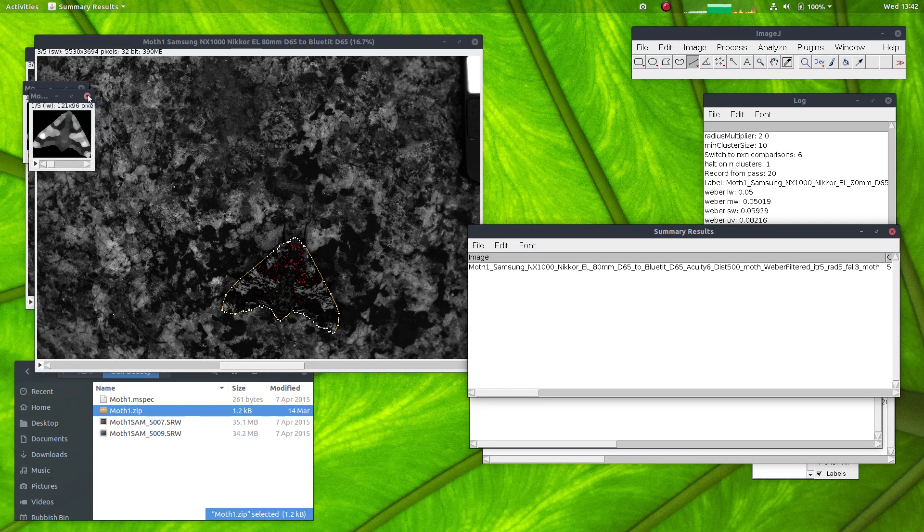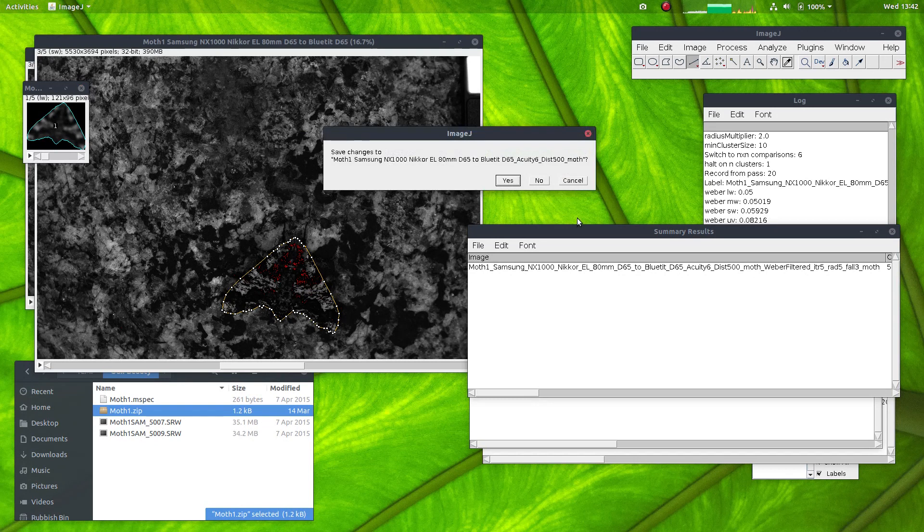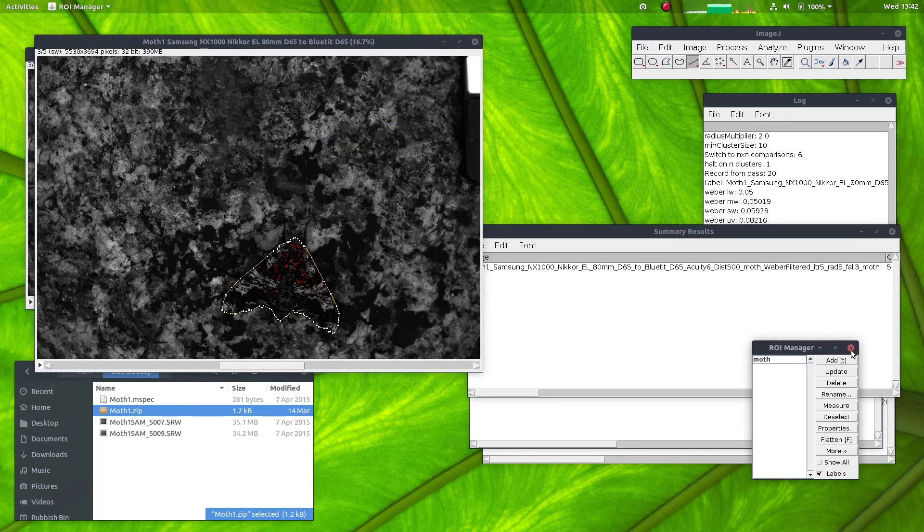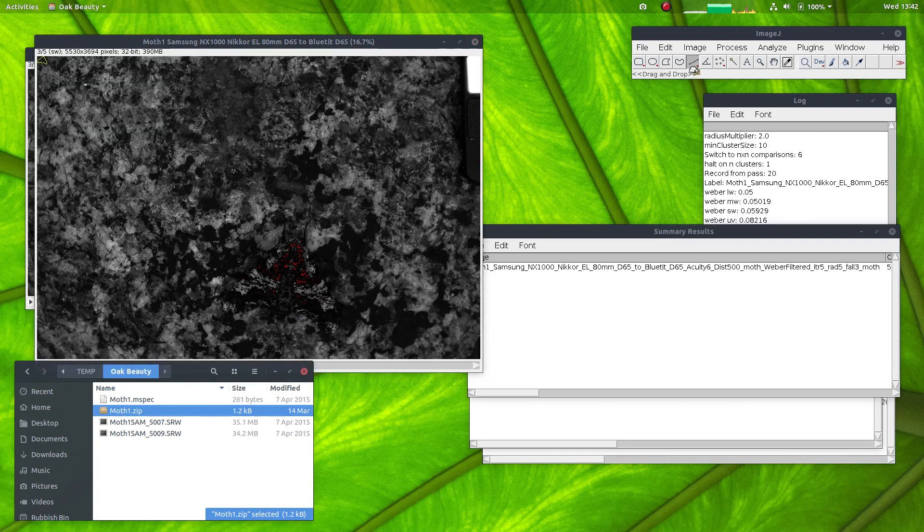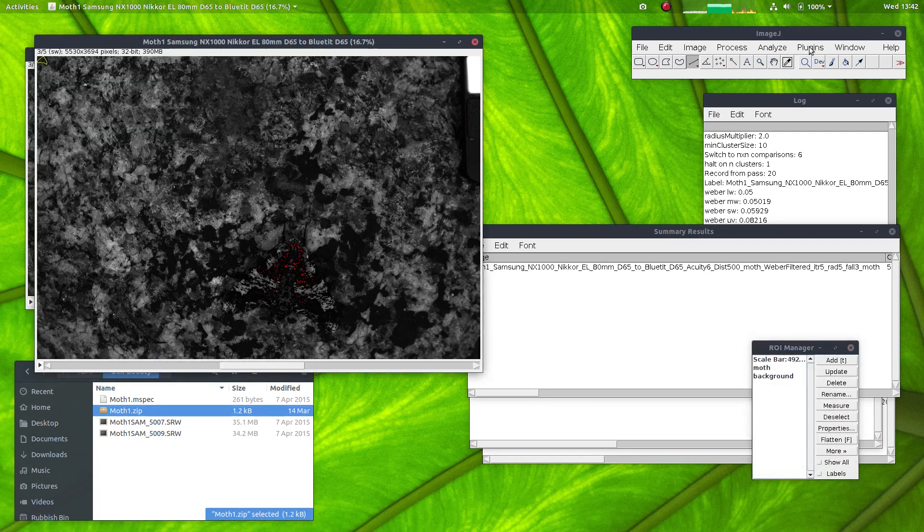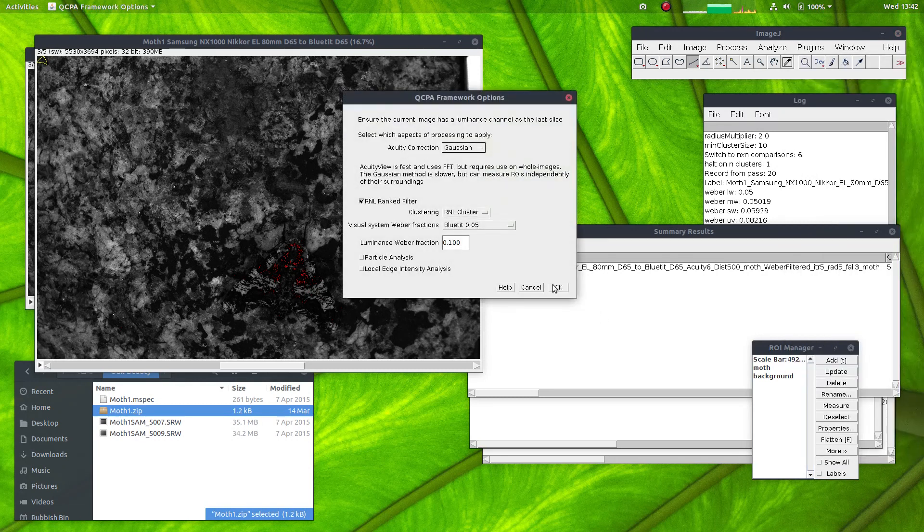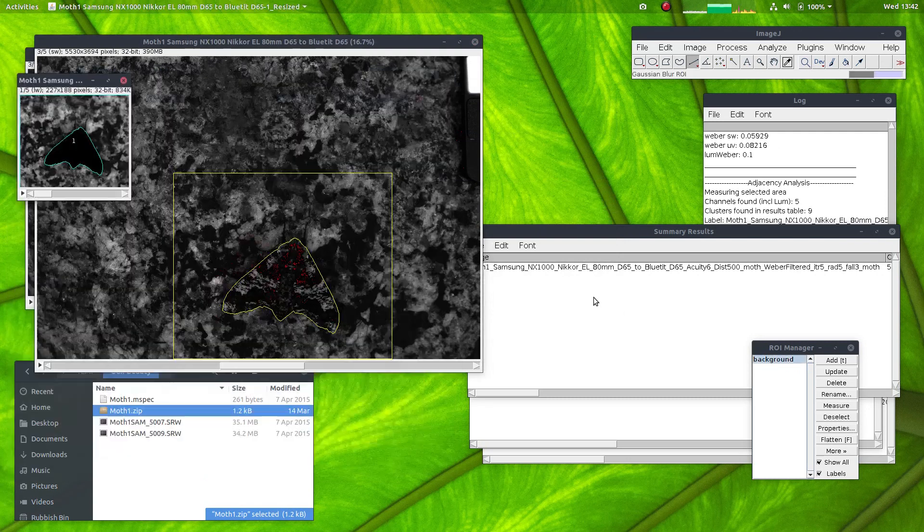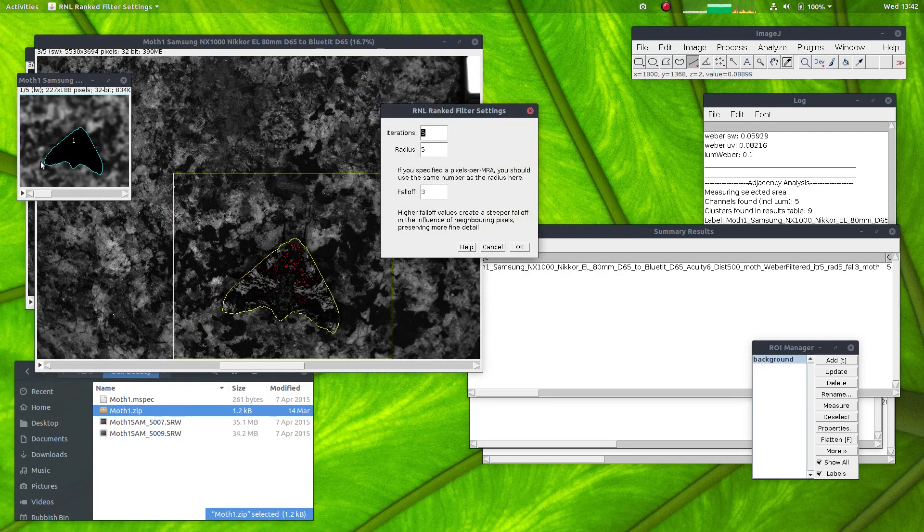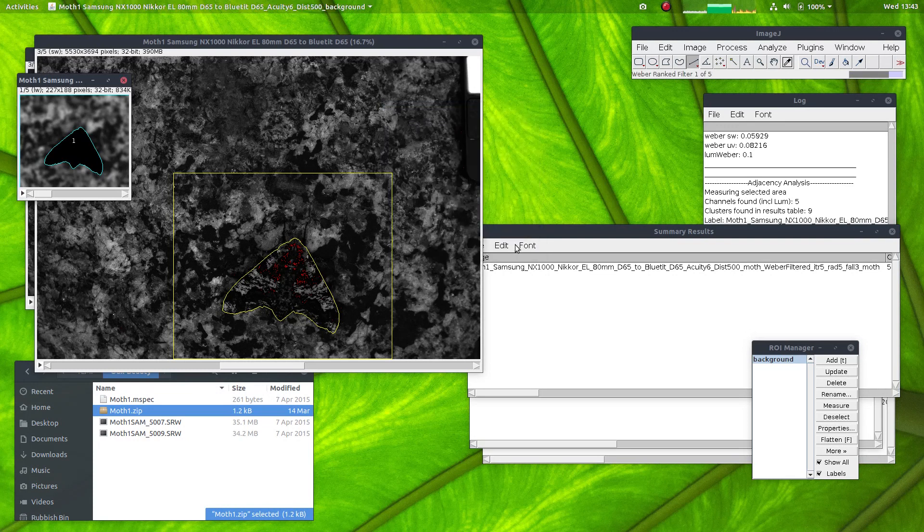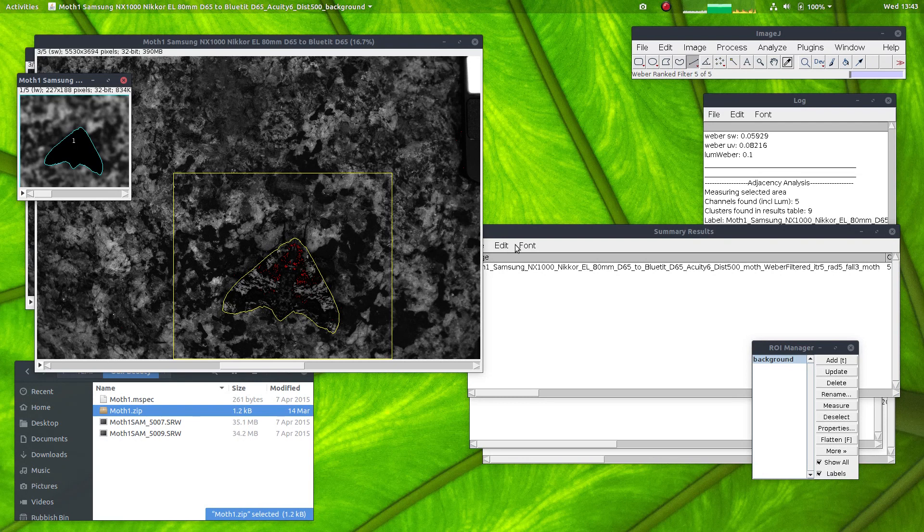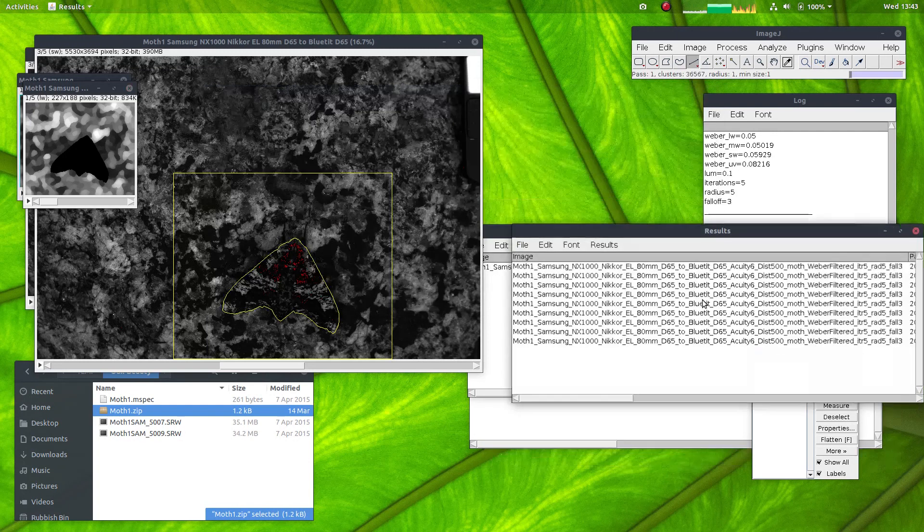I'll close all of these down, go back to the original cone catch image. The ROI again has been made very small, so I need to reload the ROIs. Now that's done, I can run the QCPA framework again, this time selecting this background region. Now you can see it's selected the background and is ignoring the moth. And I can process it with exactly the same settings.